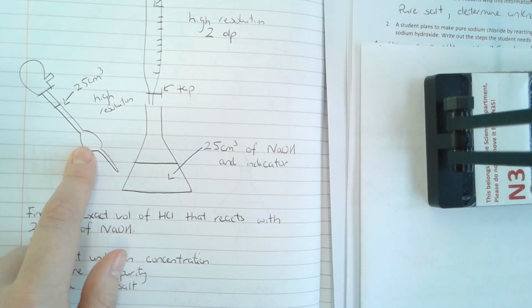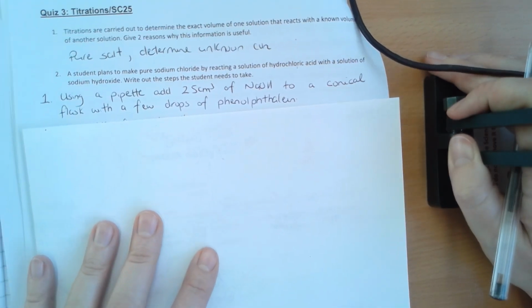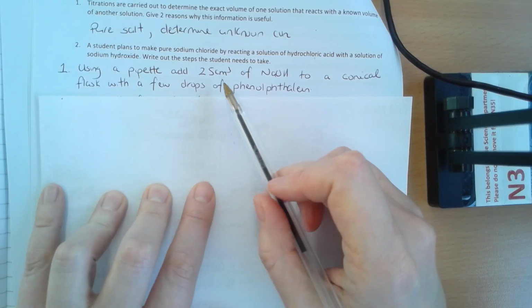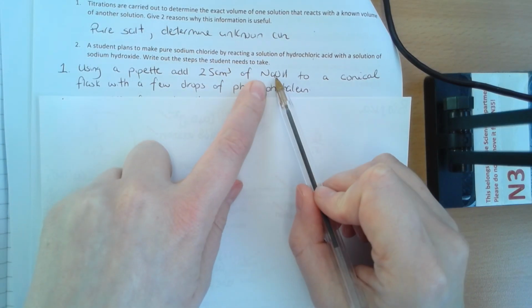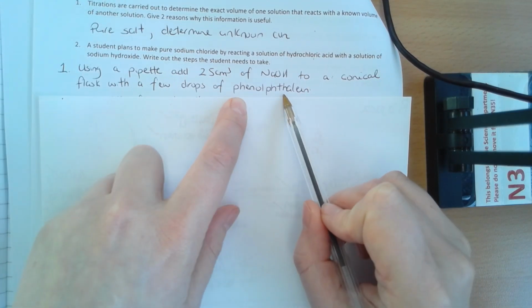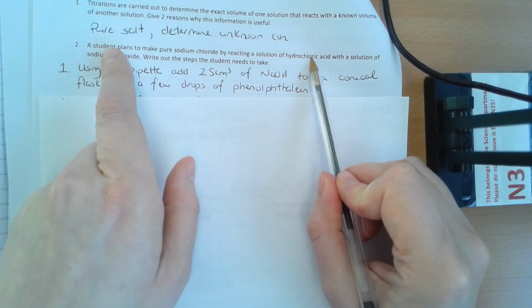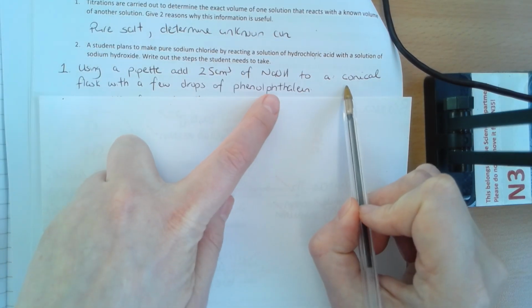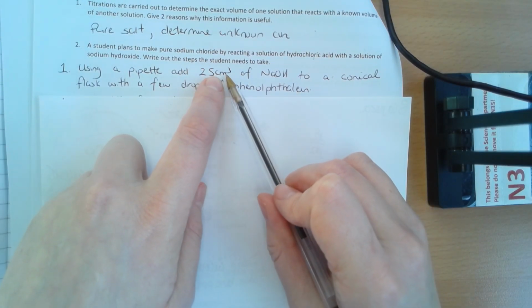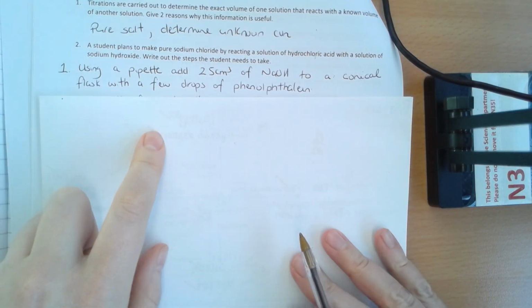So mention that you're going to use a pipette, and then you're also going to add some indicators. If I'm writing this out step by step, I'll say using a pipette I will add 25 centimeters cubed of the NaOH to a conical flask. Instead of just saying indicator, I'm going to name one. I'm going to say phenolphthalein. It doesn't matter whether the HCl or the NaOH goes into the conical flask. You don't have to say 25 centimeters cubed, although that is the standard volume used, but you should specify that it's a known volume, and you should specify that you're using a pipette.